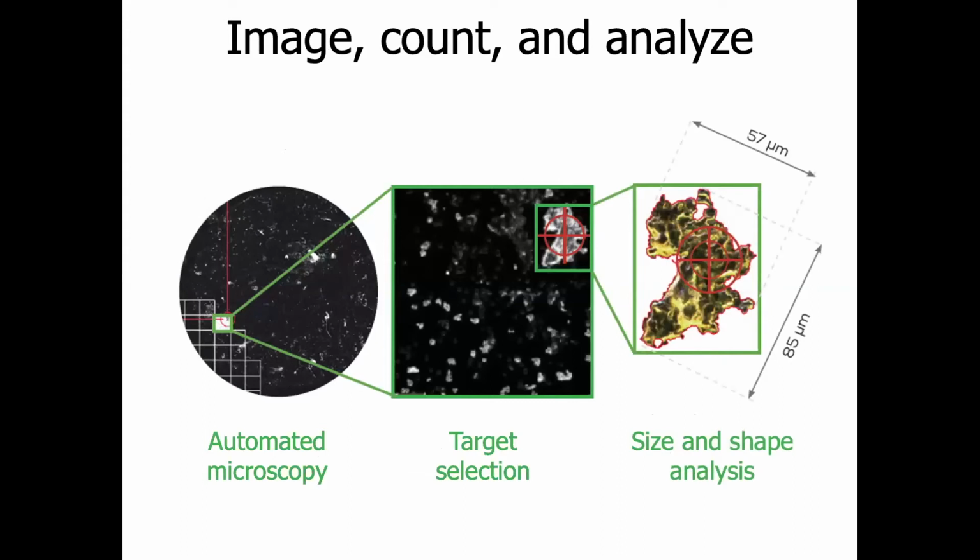Once you have your samples on Hound, there are several ways to analyze the samples. If you have isolated a specific particle you want to identify, you would probably choose a method where you just manually find the particle and use Raman and/or LIBS to identify the material.